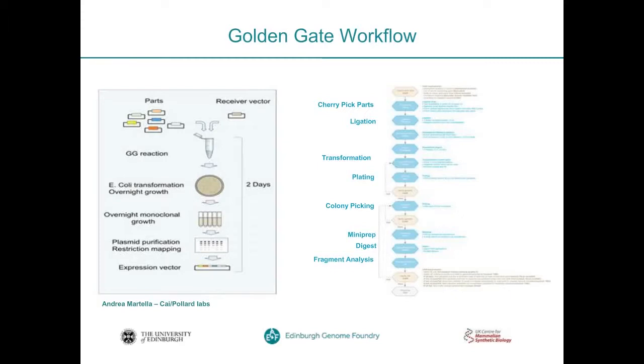So my name is Ivan. I'm the application specialist here in the Edinburgh Genome Foundry. What that actually means in reality is that my job boils down to translating the science that the Foundry sets out to do into actual robotic operations so that the instrumentation that we have can actually do it. And this includes the Molecular Devices QPix, that I will talk about in a little bit.